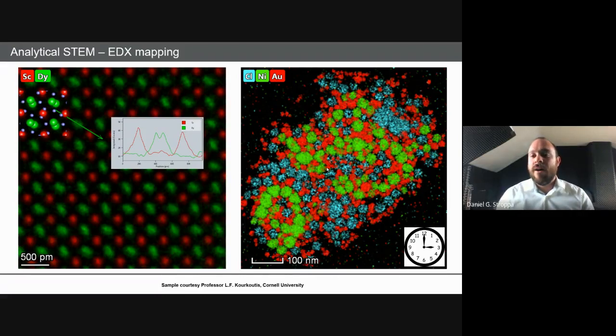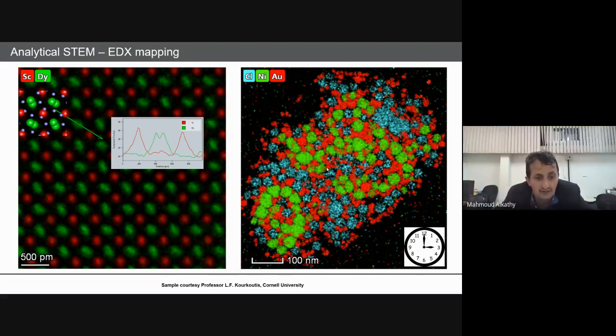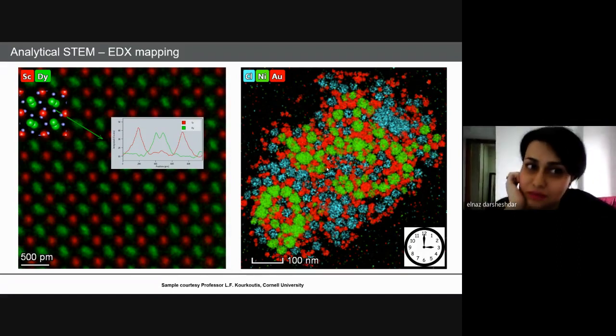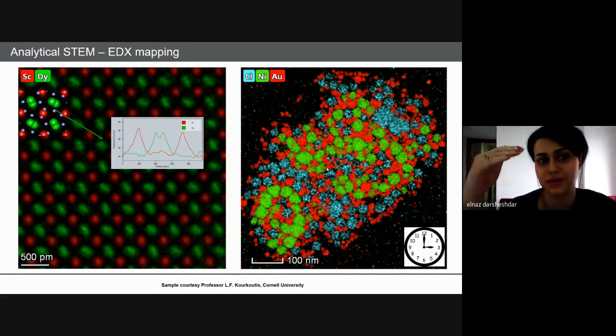Here you talk about SEM, TEM, and STEM, right? Three different measurements, I think. Actually, I've been talking only about transmission. So transmission in the traditional way, that's TEM, and in scanning mode, that is STEM. SEM is quite similar, but you don't use the signal that goes through the sample, so typically you use bulkier samples.